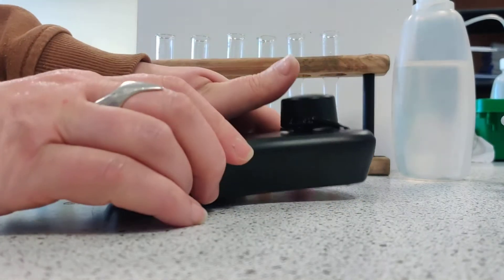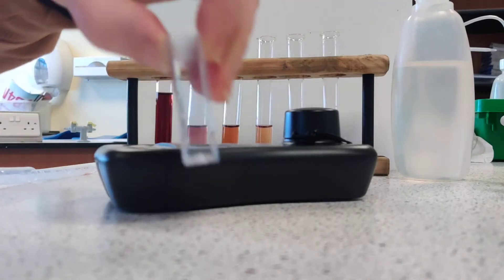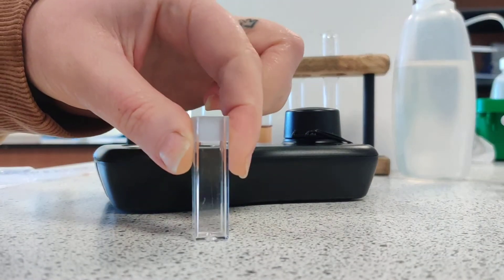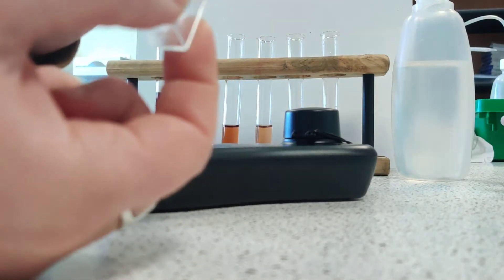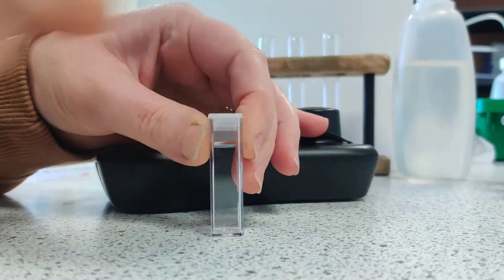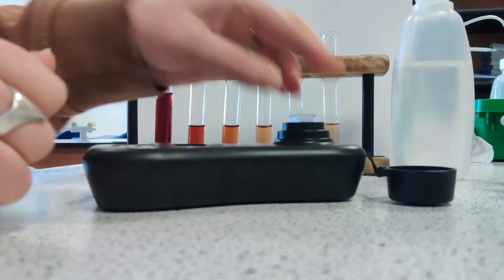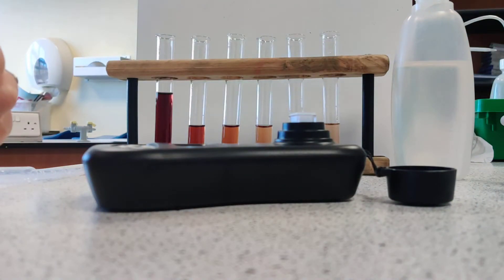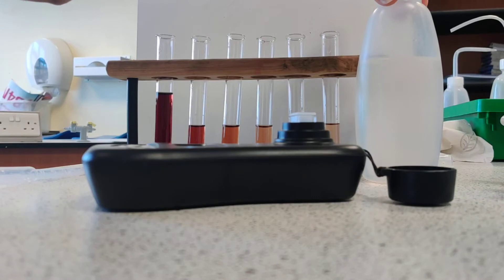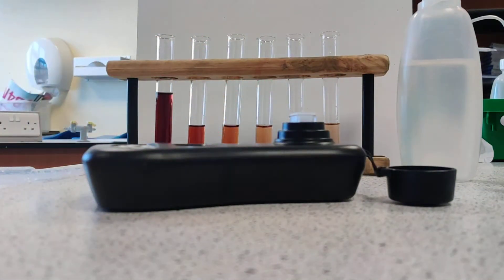What goes into the colourimeter is called a cuvette — a little sample tube, like a cuboid. It tells you at the top where to hold it, and it has a little lid on it as well. The lid stops us leaking anything when we put it inside the colourimeter. I'm going to calibrate the colourimeter now with distilled water and then work my way through each of these samples and record the reading.